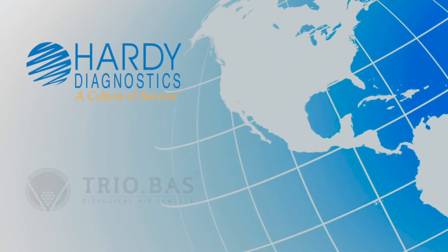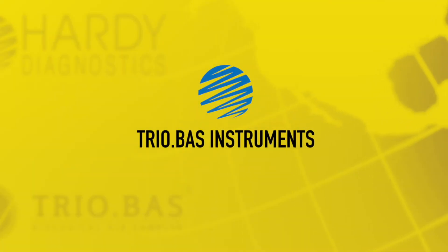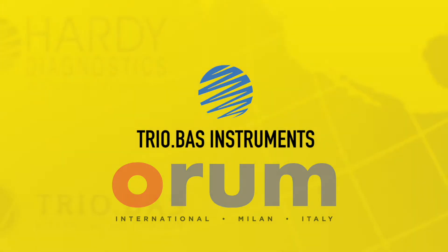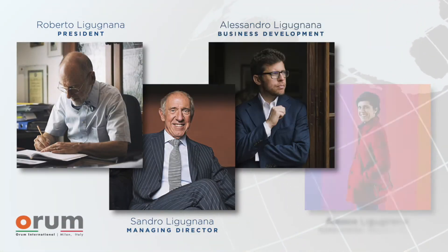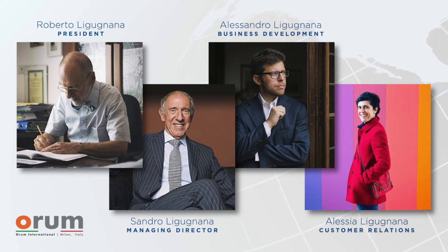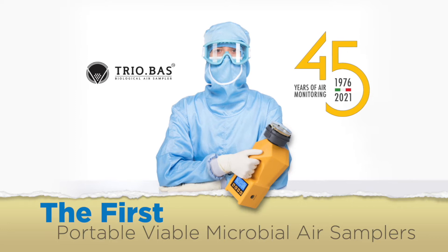Hardy Diagnostics is your TRIO.BAS distributor in North America, proudly representing these instruments from Orum International in Milan, Italy. The proprietors of Orum International have over 45 years of experience, having invented and patented the first portable viable microbial air samplers.